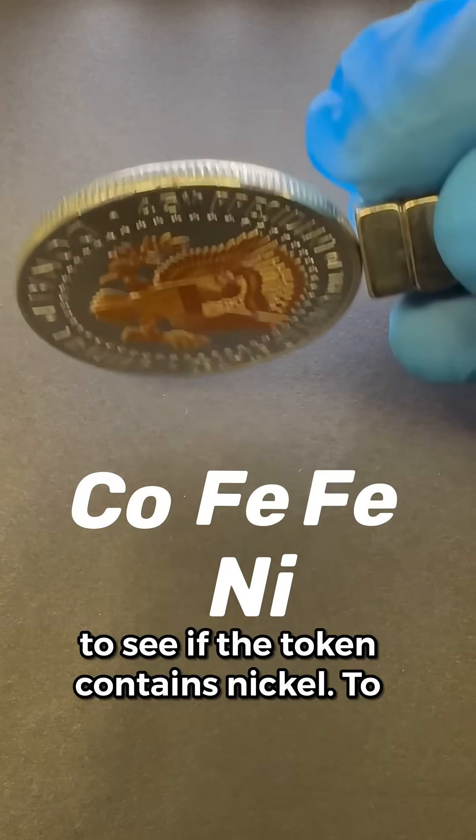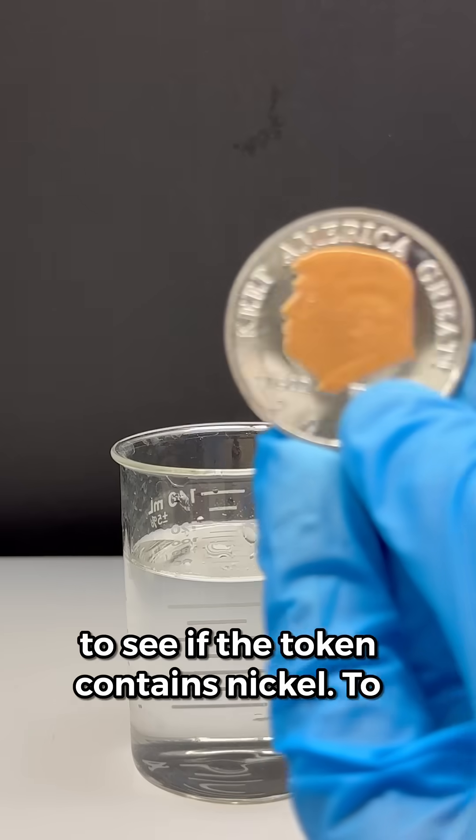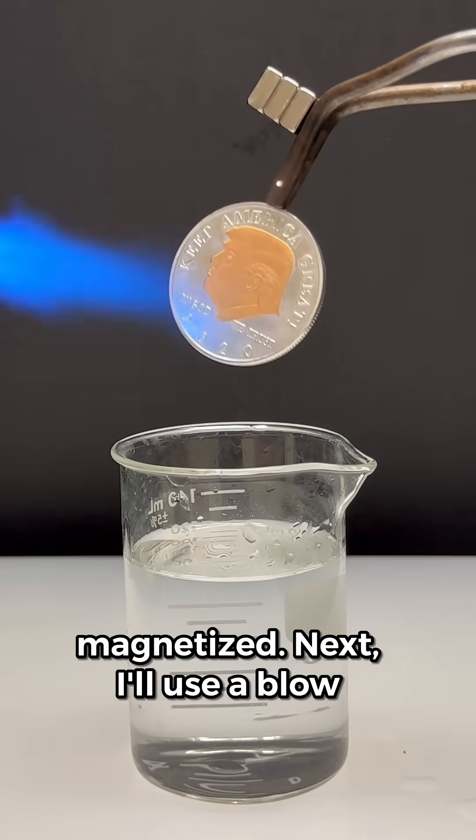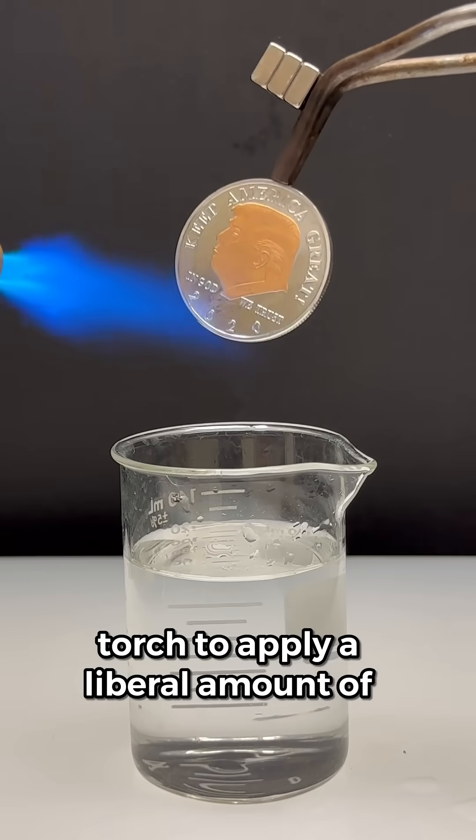We can do a quick test to see if the token contains nickel. I'll first attach the token to a pair of steel tongs that have been magnetized, then use a blowtorch to apply a liberal amount of energy.